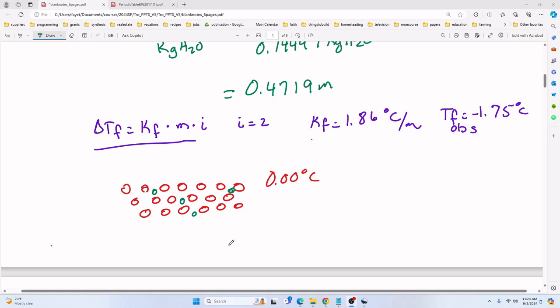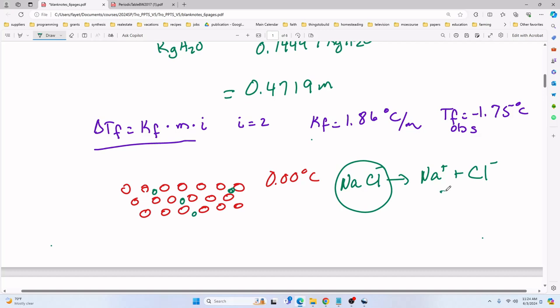But if you have an ionic solute, then when it is solvated by the solvent, you get 2 moles in the case of sodium chloride, or in other words, you're going to get more moles of solute than you put in moles of the original substance. So for sodium chloride, you have approximately a 2-to-1 ratio of ions versus moles of substance that you put in.